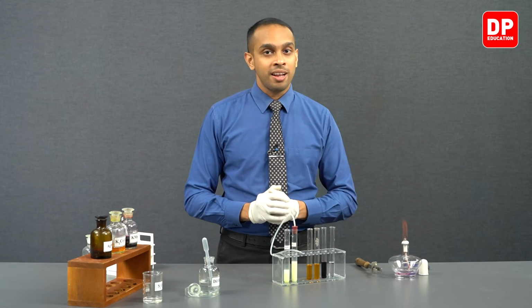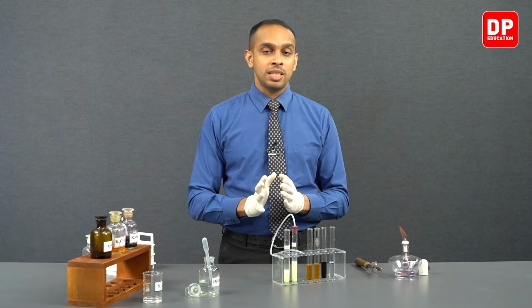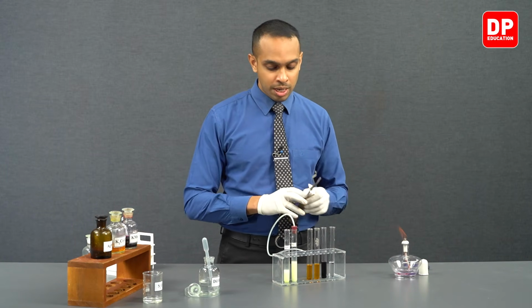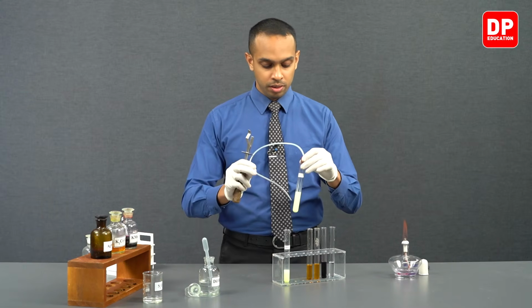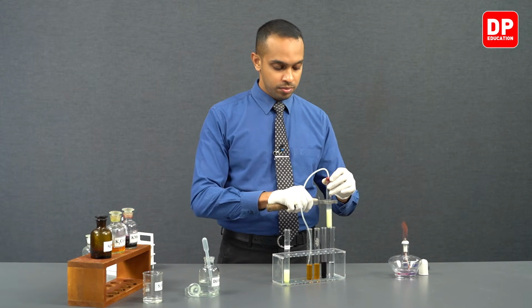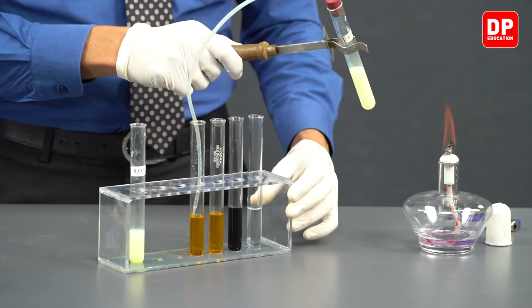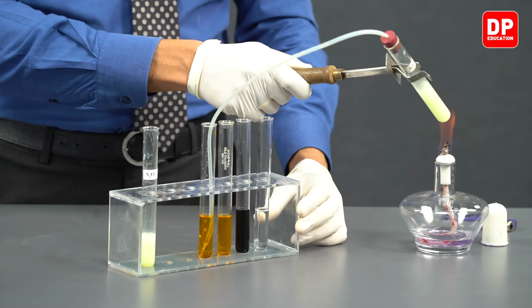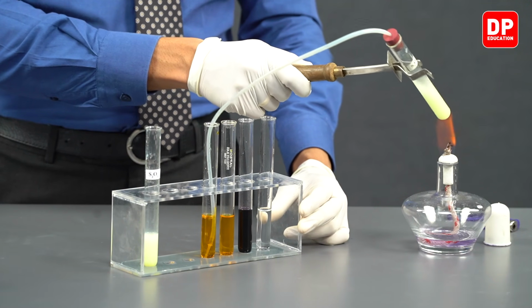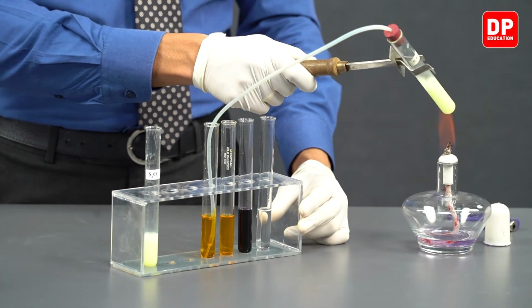Now, students, let's send sulfur dioxide through an acidified potassium dichromate solution. So we will use the same setup, and we will gently heat it until we can observe a color change in our acidified potassium dichromate solution.